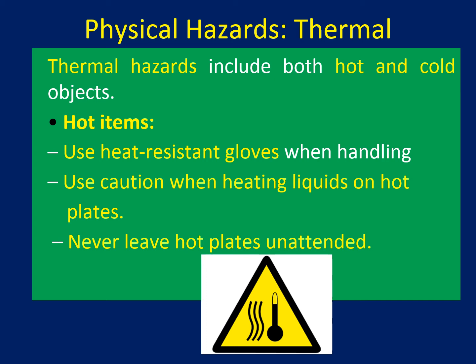If something happened, that can be a big issue, right? So please be responsible and inform and have some plan. It's better if you can switch off the hot plate around 4:30 or 5.